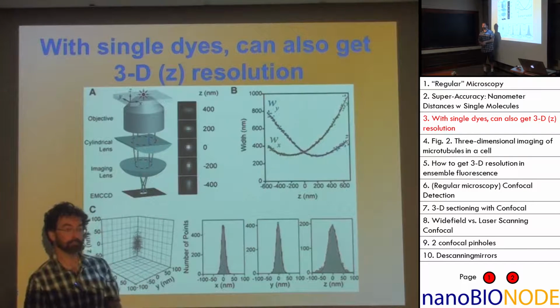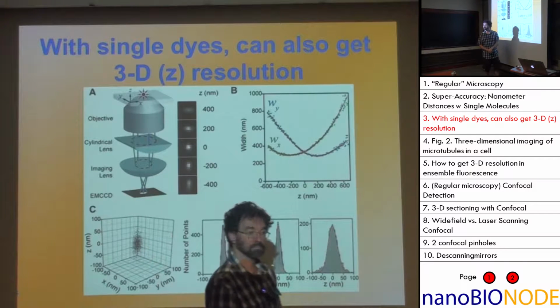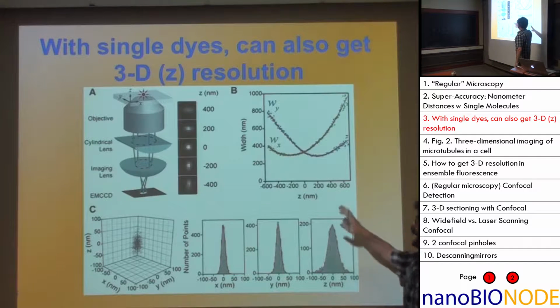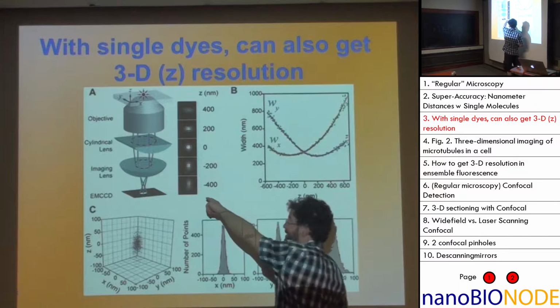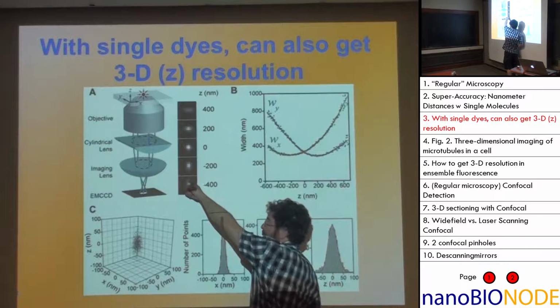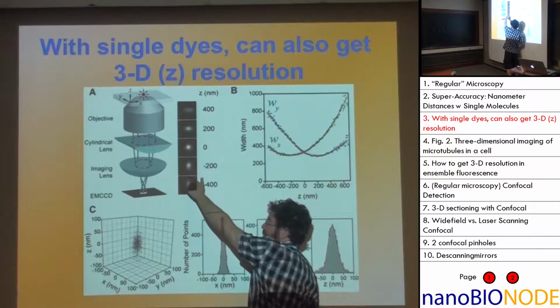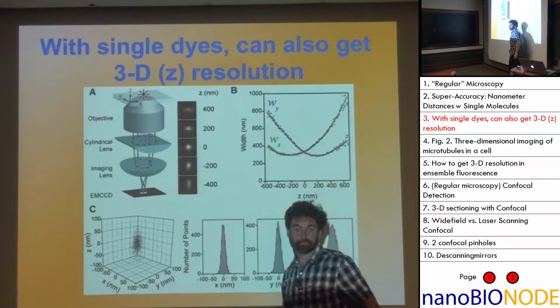But for the molecule that's at 0, if it's in focus, we get only a two-dimensional image, unless we have the calibration. Oh, absolutely. You need the calibration such that you can say if the Y-axis is this distance across, and the X-axis is that distance across.